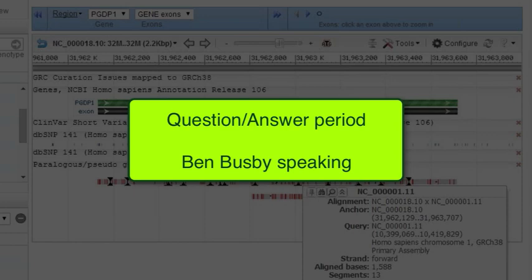Another question that's most likely widely applicable is how do I keep my data in Variation Viewer? And the simple answer to that is get a My NCBI account. So NCBI does not spy on your personal information, but we appreciate it if you sign up for a My NCBI account. This helps you store a whole bunch of types of information, including your NIH BioSketch if you apply for NIH grants, that kind of thing. You can also use it to do frequent and regular literature searches.